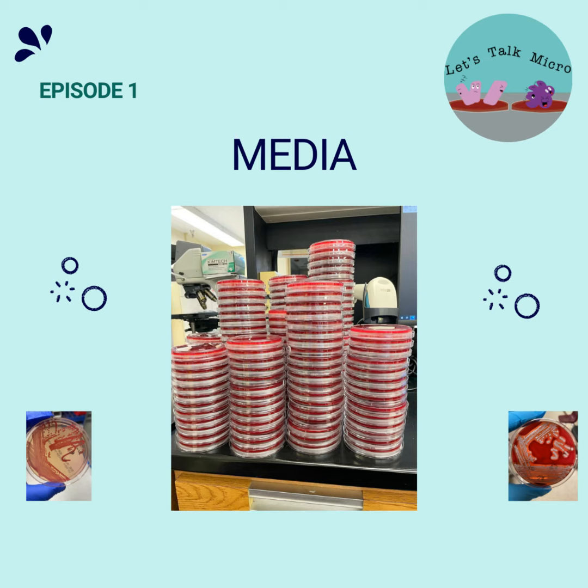And that brings the question, so we have our media, right? And how do we put those samples in the media? Well, it all depends on the source. Basically, if you have a sore throat and they swab it, if you have a cut and they swab it, you basically swab one portion of the agar. If you have urine, you stick a loop in the urine sample, and then you put that on the agar. If you have body fluids, depending on the amount, you can centrifuge it and add some of that sediment to it. So it just basically depends on the source.